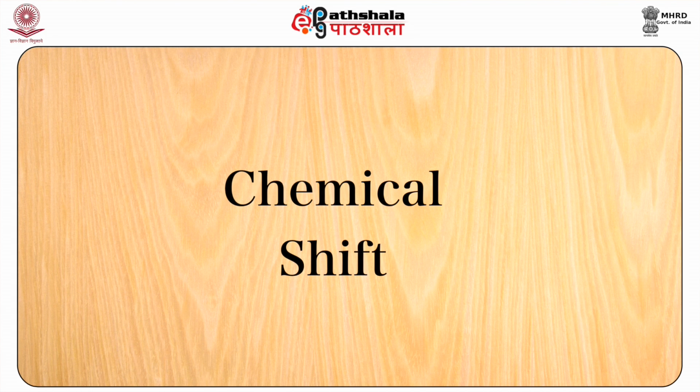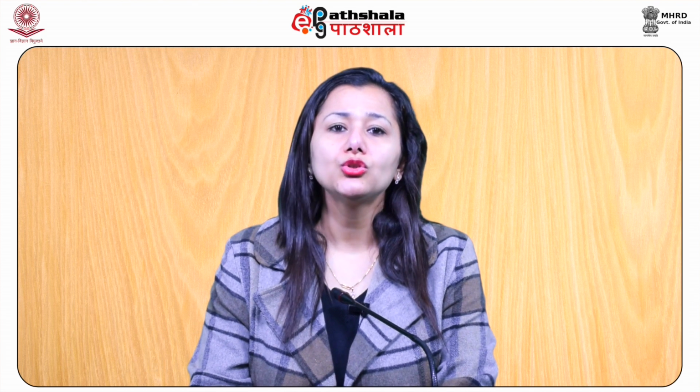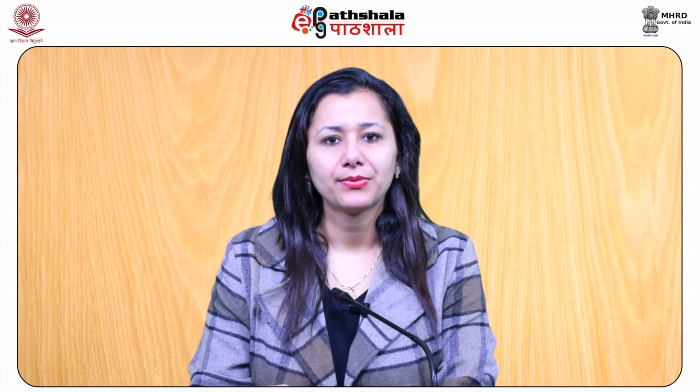Now we shall learn about the phenomenon of chemical shift. The location of different NMR resonance signals is dependent on both the external magnetic field strength and the RF frequency. Since the resonant frequencies will vary, and no two magnets will have exactly the same field, another method for characterization and specification of location of NMR signals is needed. One way of resolving this issue is to report the location of an NMR signal in a spectrum relative to a reference signal from a standard compound added to the sample.